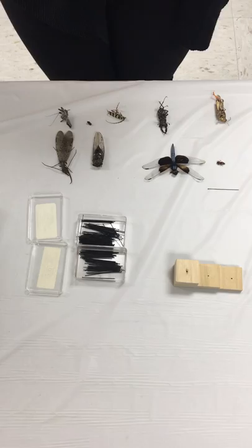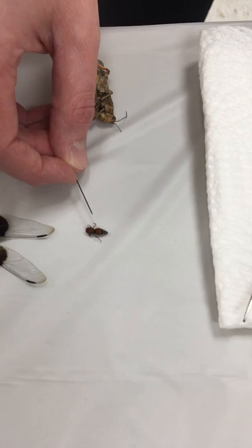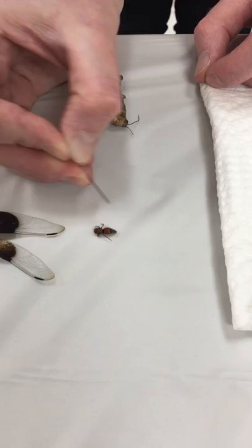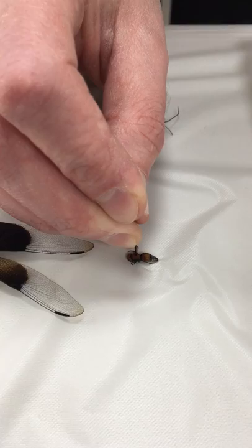We'll start with this specimen — a red velvet ant, which actually fits in the wasp family. As mentioned, this type of insect must be pinned in the center of the thorax. Here we have the head, the thorax where the legs are attached, and the abdomen on the back side. I'm going to take my pin and try to pin it in the center, getting it as straight up and down as I can.